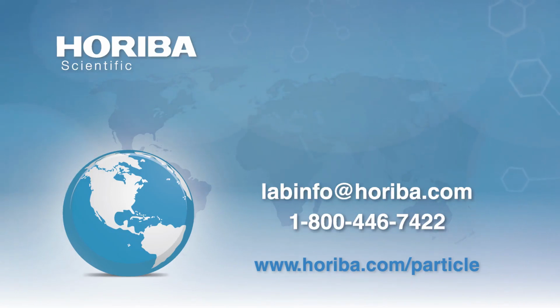Best range of ultrasound for silica for TM50? TM50, if it's Ludox, if you get fresh Ludox, which means you haven't left it in the lab to crystallize for two weeks like I have, you don't really do much of anything to further dilute it. Quite often you can take TM50, and for particle size I'll be using dynamic light scattering, and I will dilute it in salt water and then make my measurement. Away you go. You just need some gentle stirring. And that's because they charge the bejesus out of it. So it's a very highly charged particle.